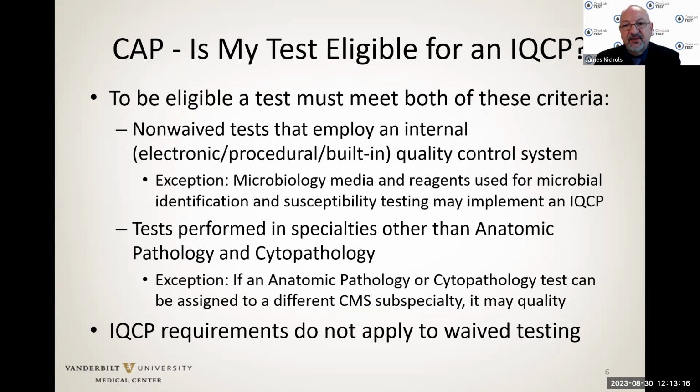The exception is if anatomic pathology and cytopath tests can be assigned to a different CMS subspecialty. It may qualify. And IQCP requirements, as I mentioned, don't apply to waived testing formally by regulations, but laboratories really can benefit from running through the exercise, determining your weaknesses, and coming up with a quality control plan to minimize errors.